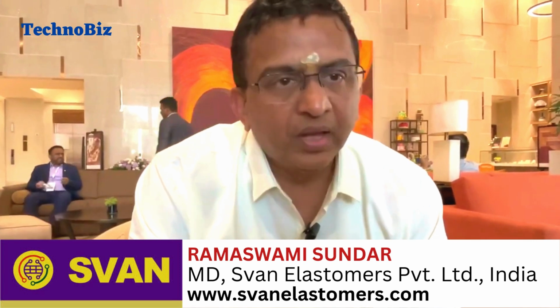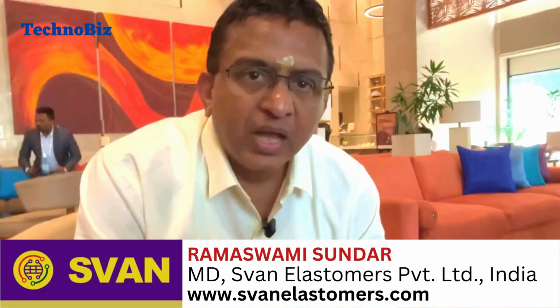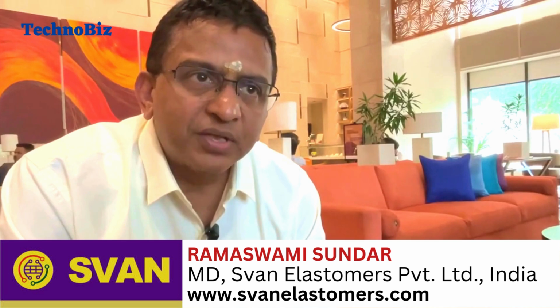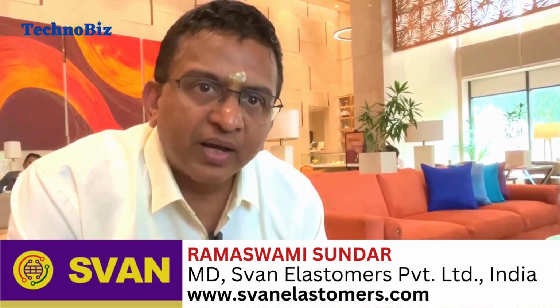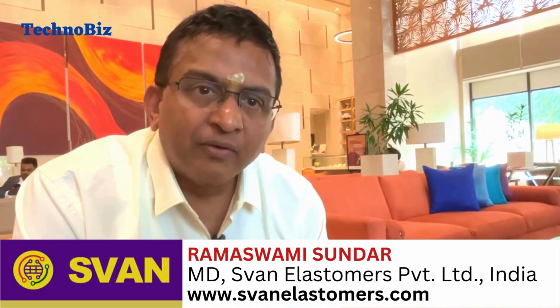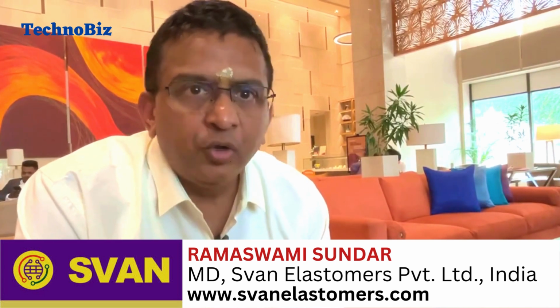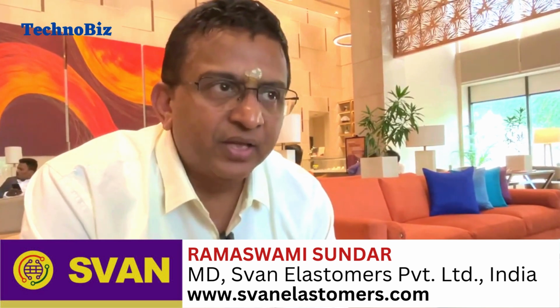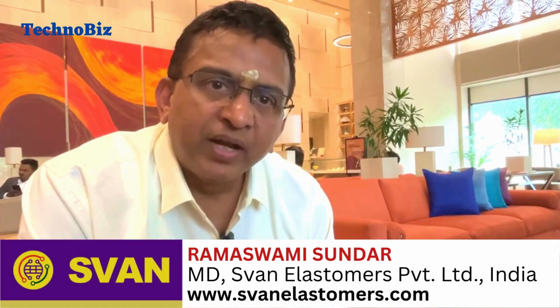So this is molding. Now, I told you in the beginning that I'm going to talk about rheology, which will link these two aspects. So why is rheology important to link these two? Because rheology testing is done on an unvulcanized compound which is vulcanizable. That means it is ready to be vulcanized, but it is not yet vulcanized. What do we do in a rheometer? We take a small sample, typically about 5-6 grams, very little. You measure it accurately, and you put it in a rheometer.